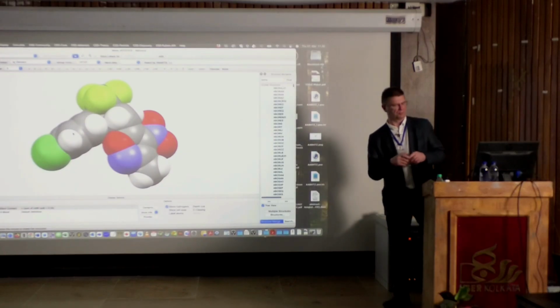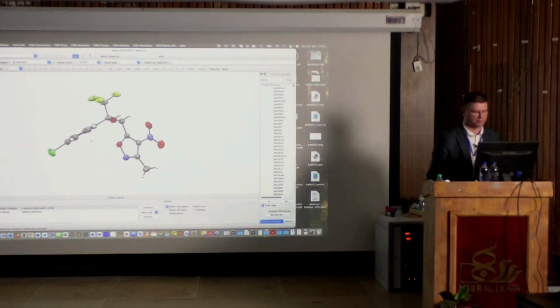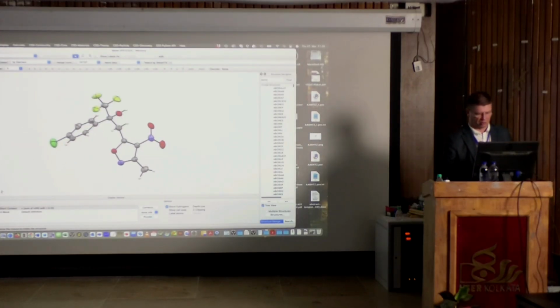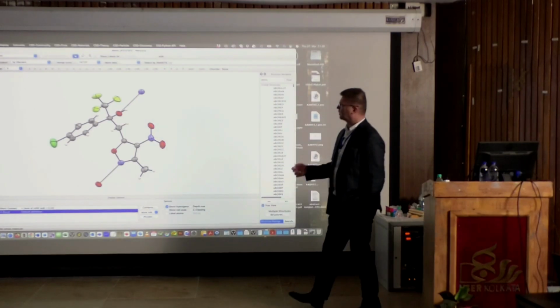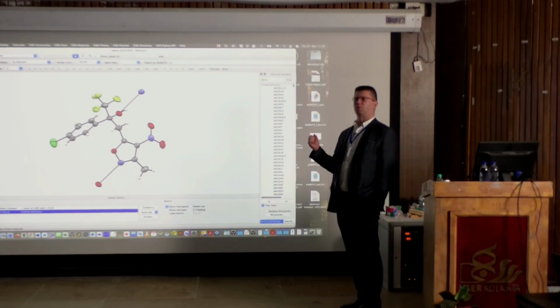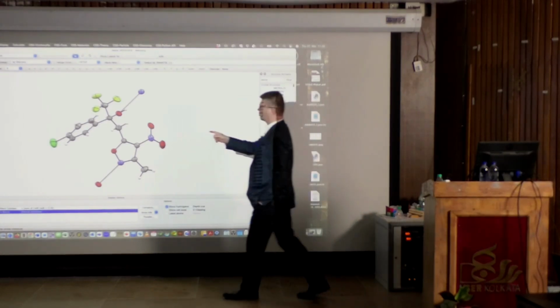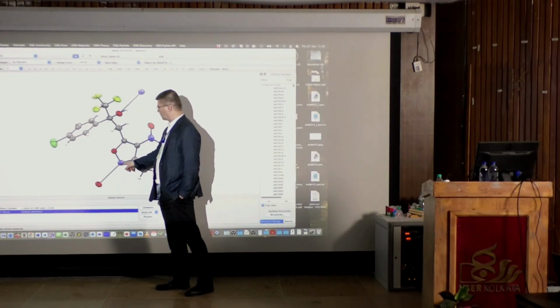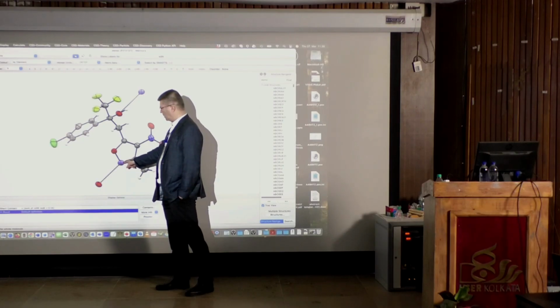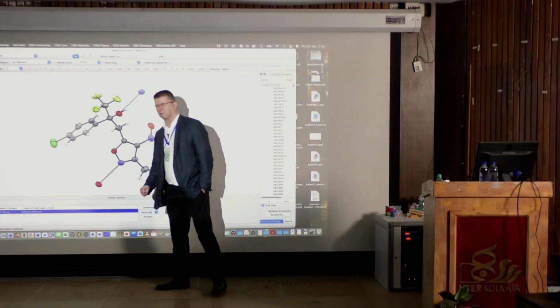But I will show you now very briefly about the hydrogen bonding. I will go back to the ellipsoid presentation like this. And now, here in the lower part, there is a nice note which says, look, hydrogen bonds. And now it is looking, but it's not doing anything more than just looking for what is the nearest acceptor atom. Because here is a donor. Now, this donor is hydrogen bond. But now in here, there's no problem. This is an acceptor. But now it thinks that there is a molecule here, or atom, which could be the donor.